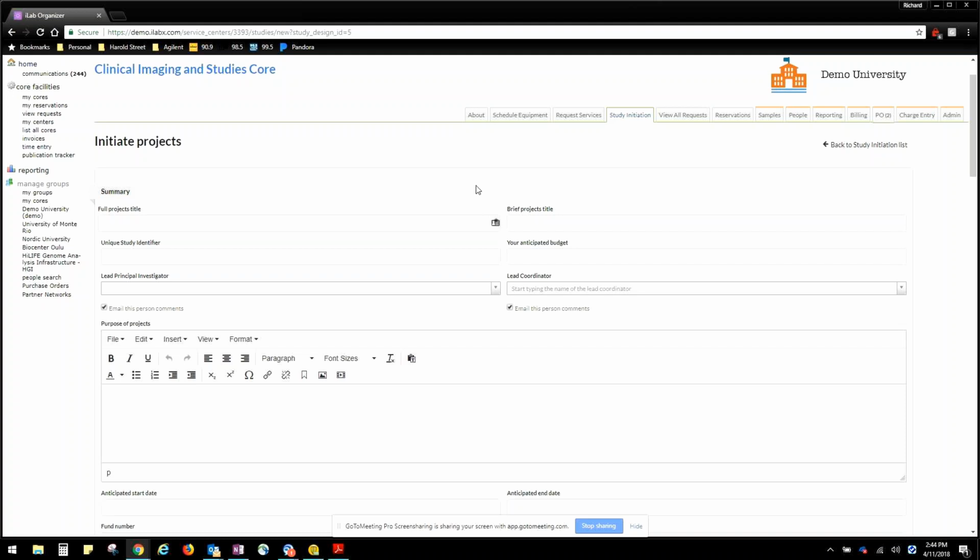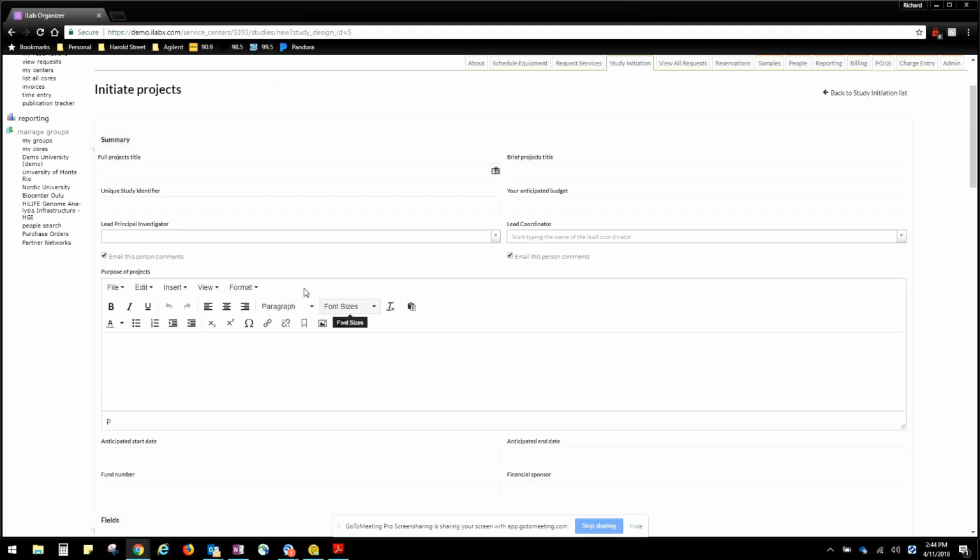So yeah, let me show you an example actually. Hold on here, okay. So if we go to this unique study identifier, this is where you would include a de-identifier or a code. If you guys are using PHI and you want to put something that pertains to a person, maybe it's Joe Smith. That's a section where, if it's relevant, you can keep it. But if you think it's just going to become daunting, or it's just going to confuse people, you can actually turn it off.